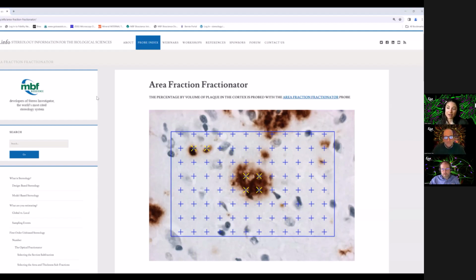And so if anybody has any data that they'd like us to try out with these specific algorithms, to see if the product works well with their data, we would be glad to help out with that. And if you'd like more information in general on what Solaris is designed to do, there's a survey after the webinar, so please let us know in that and we can be sure to follow up with you.